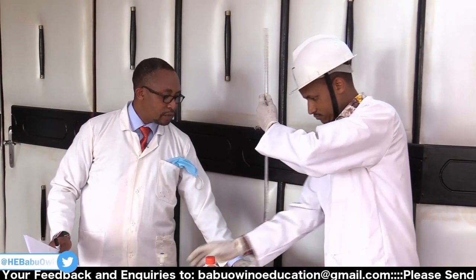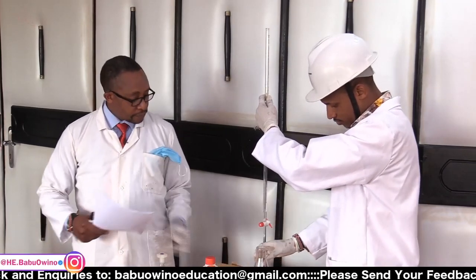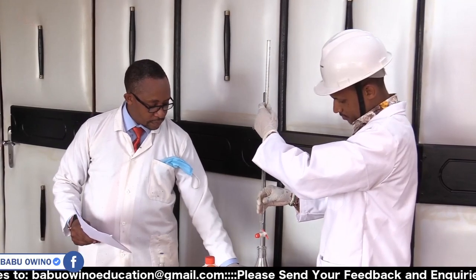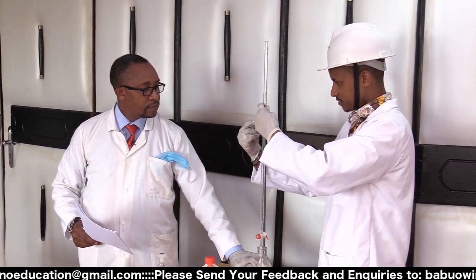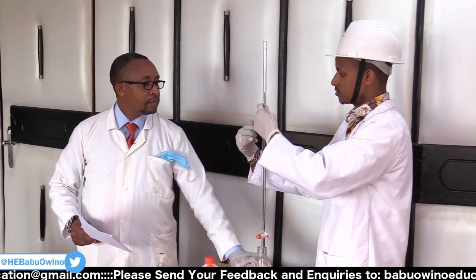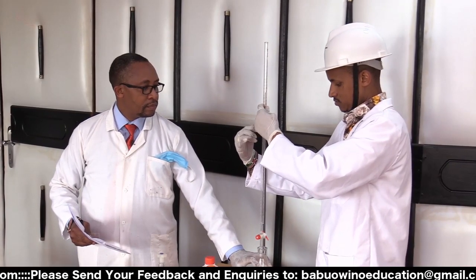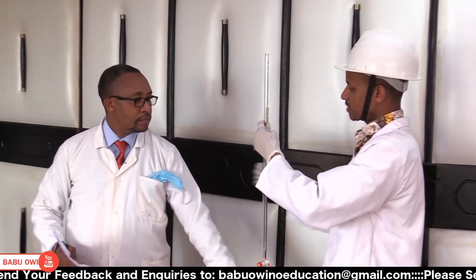Remind them the graduation's facing you. So you place your conical flask, then place your burette just slightly at the tip of the conical flask. Then the graduation should face you as you are doing your practical. The graduation on the burette. Graduations are the marks, the markings.